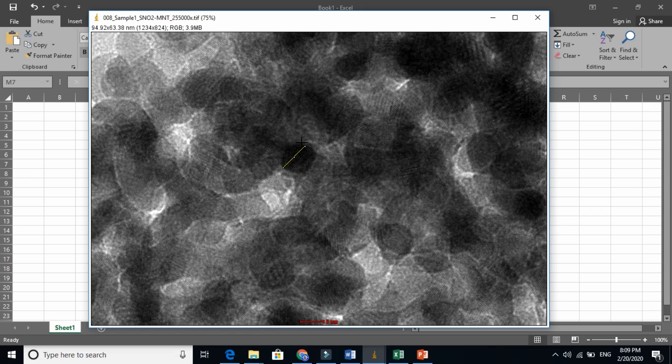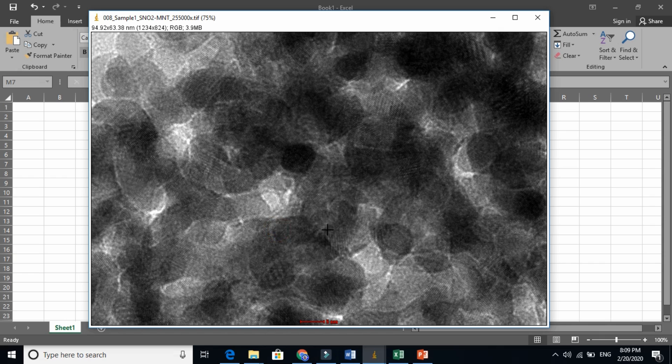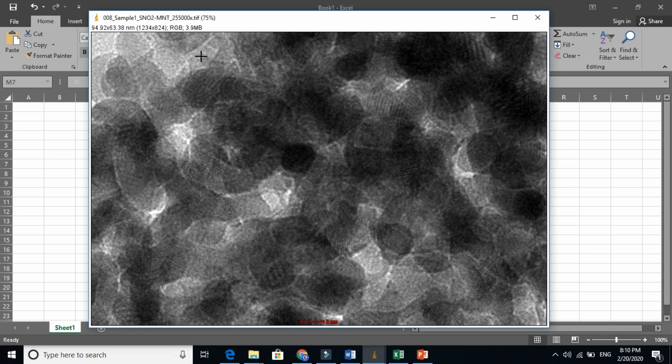Let us count the grains here. One grain, two, three, four, five. Let us see here. One grain, two grain, three grain, and four grain.